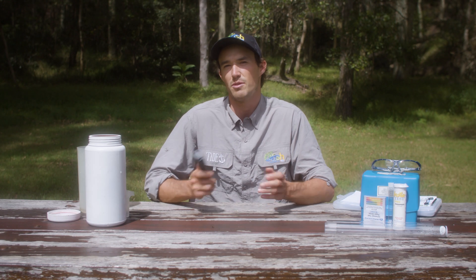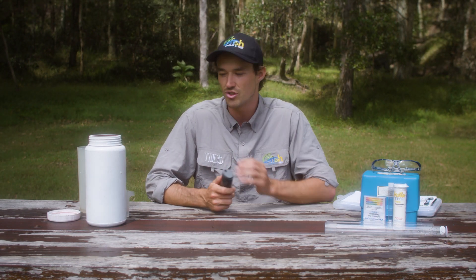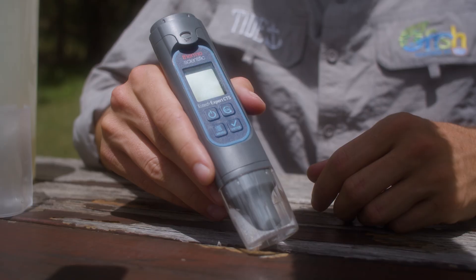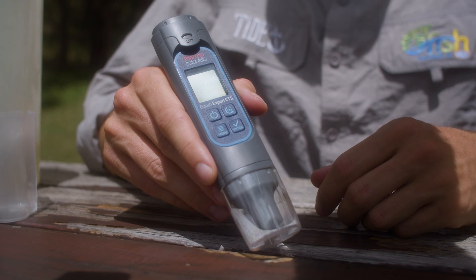We've gotten ourselves set up here straight after collecting our water sample, just so it's sitting around for as little time as possible. Now we're going to start testing, first looking at electrical conductivity and temperature using our digital probe. When measuring electrical conductivity, we're looking at how easily electrical current can flow through our water sample, and this is basically determined by the level of salt dissolved in the water. The higher the concentration of salt, the greater that conductivity is going to be.